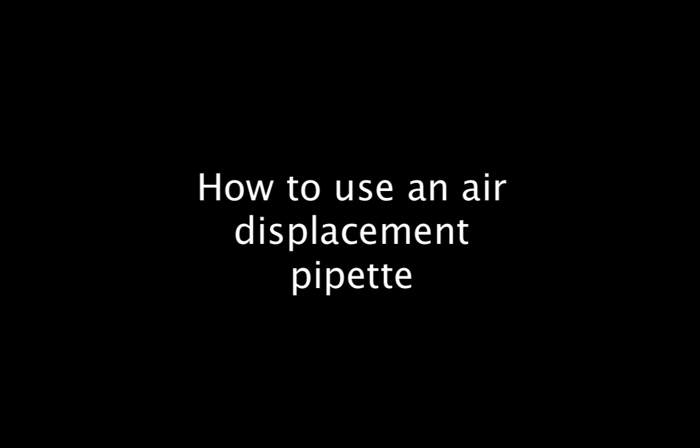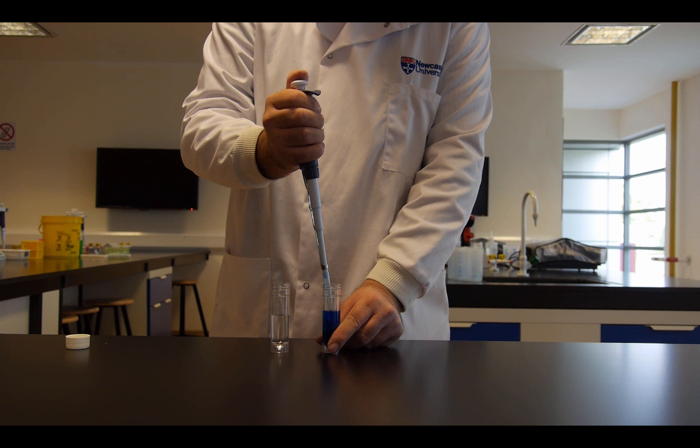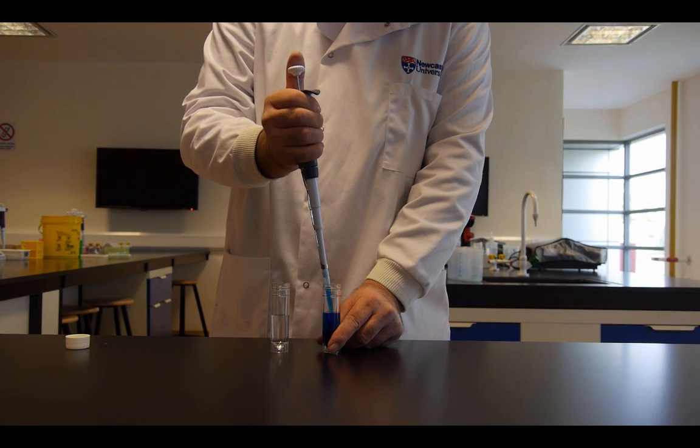In this short video we're going to look at how to use an air displacement pipette. With a pipette tip fitted, push down to the first stop, place the tip in the liquid and slowly bring up your thumb.